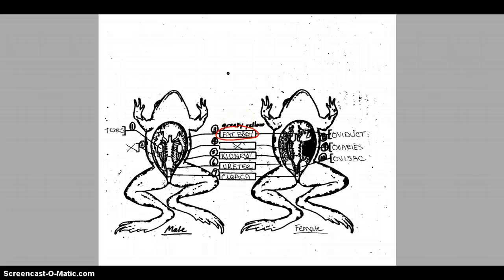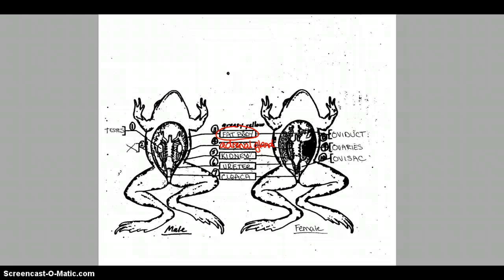Going through more internal anatomy: the fat bodies look like greasy yellow fingers, store fat, and are attached to the anterior end of the kidney. Students often have trouble finding the kidney, but the fat bodies are easy to find — locate them and look at the bottom area to find the kidney attached there. Also found on the kidney is the adrenal gland, which appears as a yellowish stripe and produces hormones. The kidneys themselves are dorsally located, almost on the two sides of the frog's spine, and their job is to filter blood for waste products.